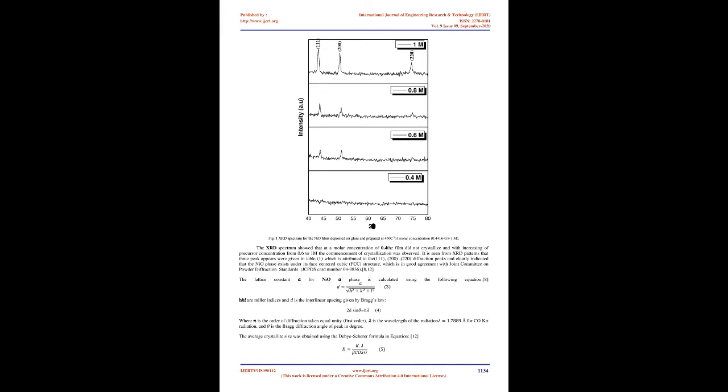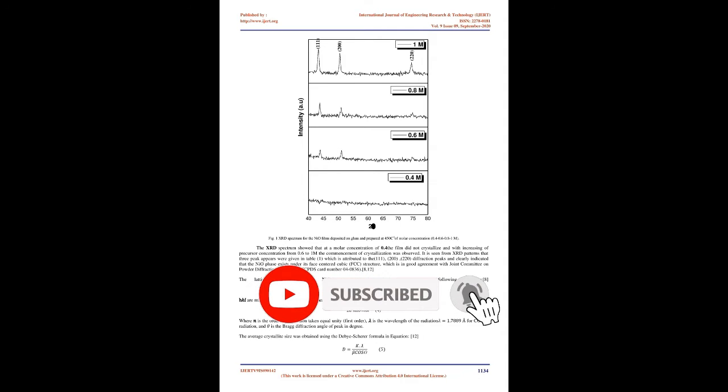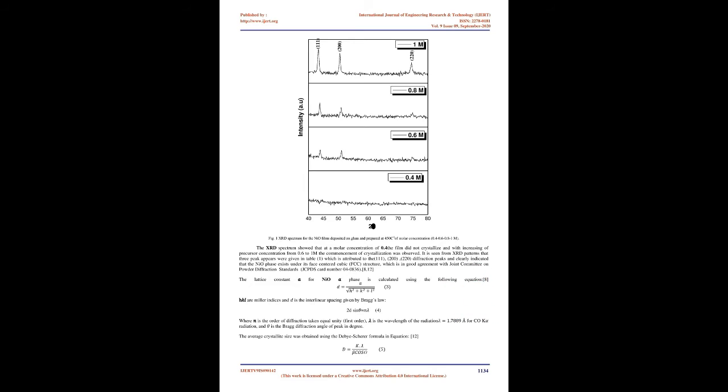Transmittance spectra were recorded using the spectrophotometer in the range of 330-2200 nm. The absorption coefficient and the optical band gap energy were calculated. The band gap of NiO film decreases from 3.7 to 3.2 eV as the molarity increased from 0.6 to 1 M. Both the electrical resistivity and the activation energy of the prepared films were calculated.